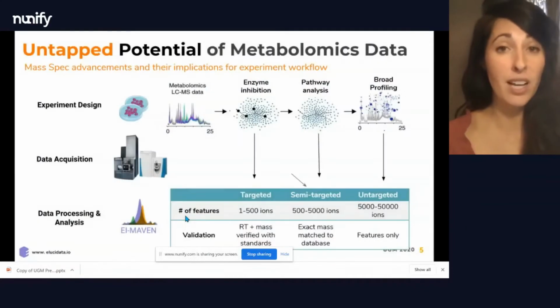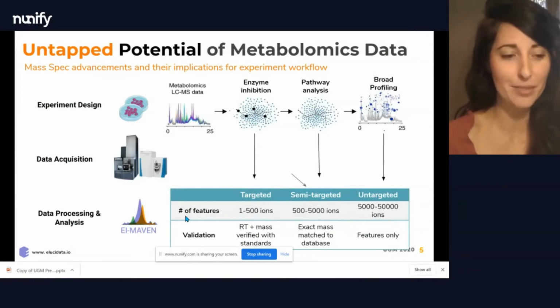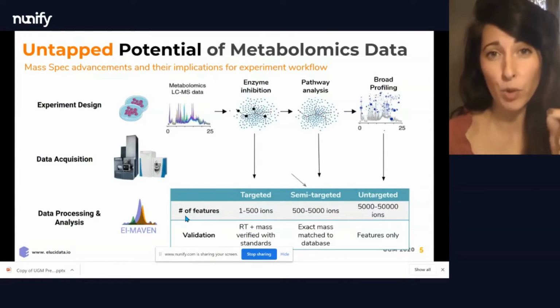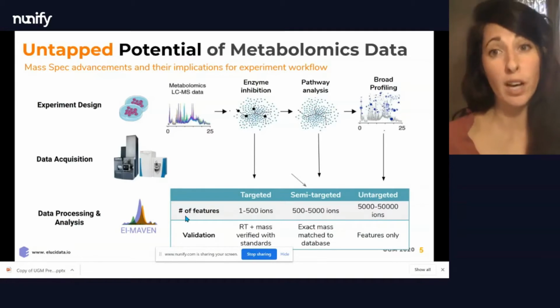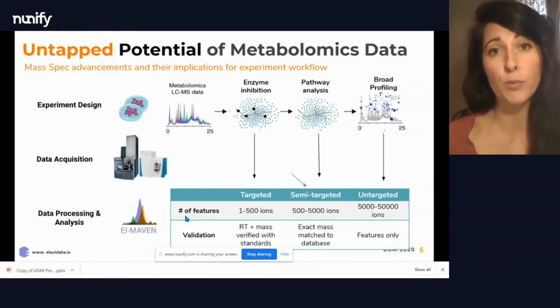And because of this, this does require for us to have capabilities to conduct a wide range of experiment workflows when we need to measure lipids and metabolites. For example, sometimes we just need to look at a specific chemical reaction in the cell, and this is just honing in on those enzyme precursors and products. We do a lot of work also when we're looking at a pathway flux analysis, and this is when we utilize stable isotope tracers to measure all of the intermediates within a pathway.